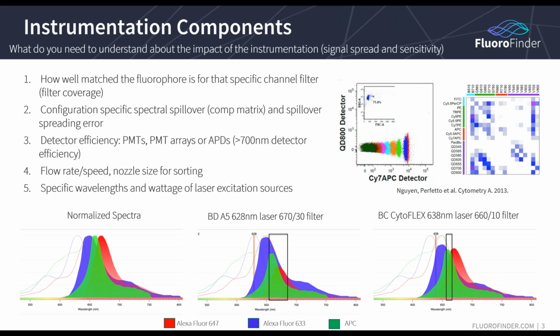laser in order for it to represent, from 100%, what the diminishment was due to a loss of efficiency due to that laser line. Eventually, that's something that I want us to incorporate into IntelliPanel as well in order to affect the overall brightness that we assign to the fluorophore.